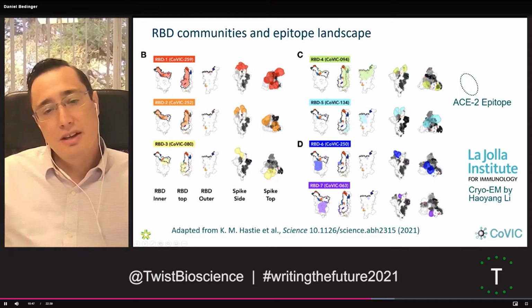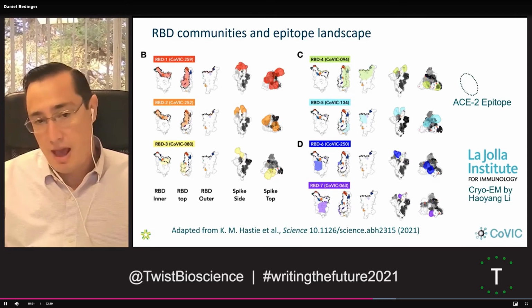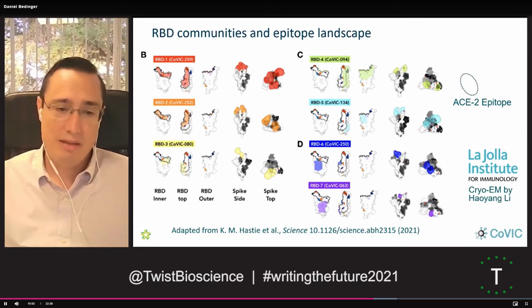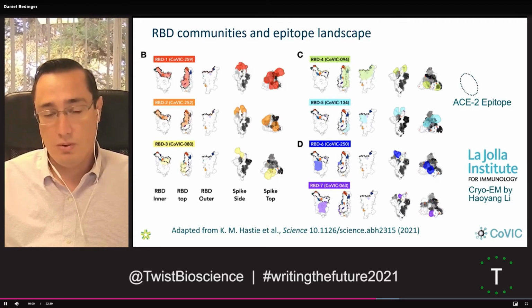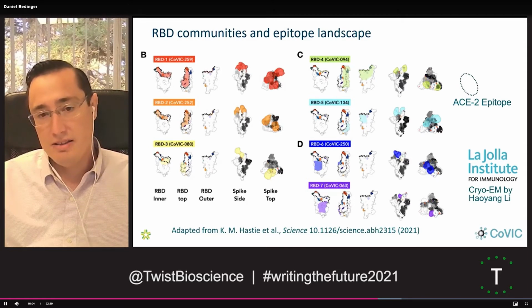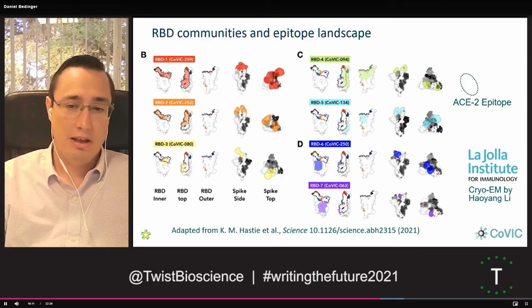And so using the sort of known, you could always think of these as pathfinder antibodies from the cryo-EM data, we can know exactly where all of the clones in the set bind and which face of the molecule. So again, this will inform the conformational state the antibodies can recognize, their stoichiometry of binding, and also what mutants of the receptor will be affected by the binding.